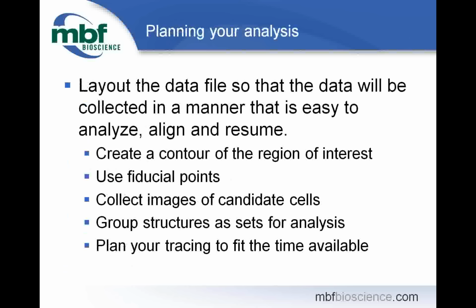Let's move on to the data file so that we can get on to using Neurolucida. So I'm going to talk about setting up the data file in the workspace right now. Just take a couple of minutes before we go to the microscope.